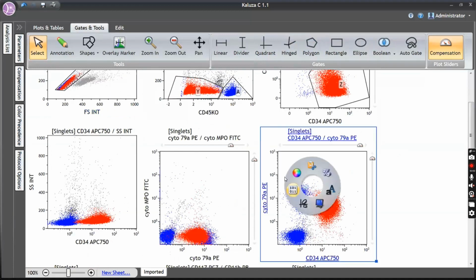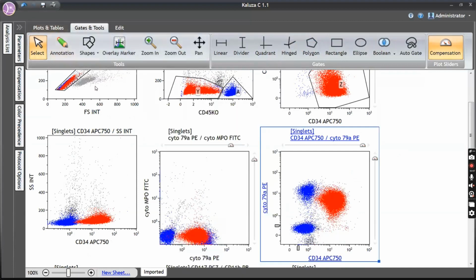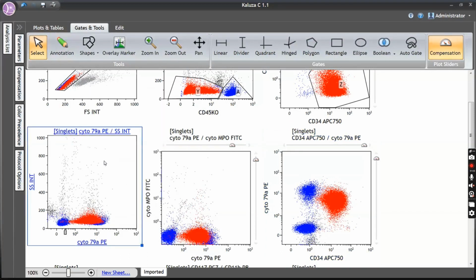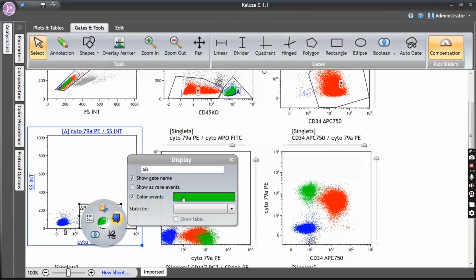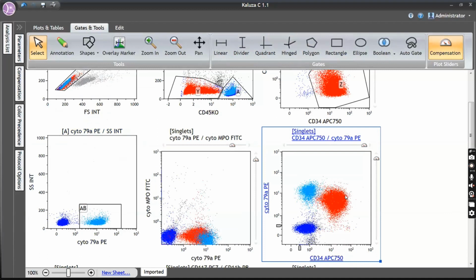I have an internal and a positive control. CD79a is a B cell marker. If you want me to give a color to the B lymphocytes, I just gate the lymphocyte population, which is here, and give it the Twitter blue or sky blue color for the normal B cell population. Now I have an internal control. What is the expression of CD79a? I'll draw a quadrant like this.